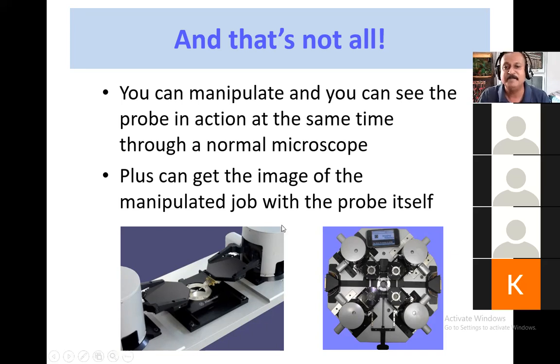And then you see here that this picture is again very interesting. Instead of using just one probe here, there are two probes which are working together. For example, one probe is doing the manipulation job and the other probe is doing the imaging part. Two probes together.